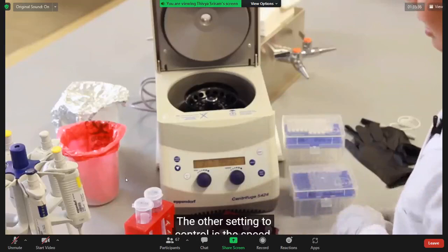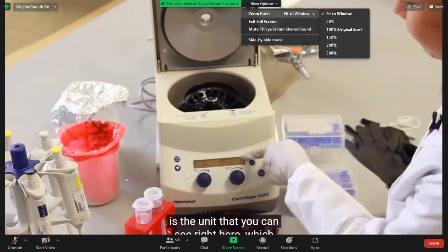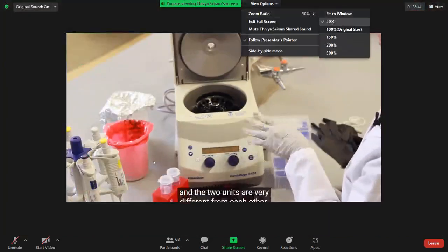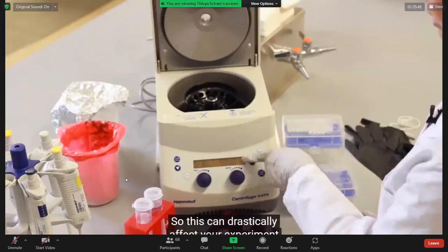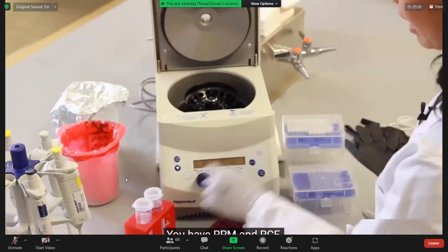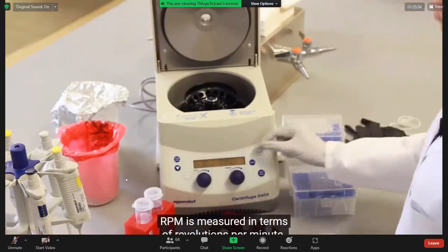The other setting to control is the speed. The important thing to take note of is the unit that you can see right here, which is in RPM right now. There are two different speed units, and the two units are very different from each other, so this can drastically affect your experiment if you're using the wrong one. You have RPM and RCF.